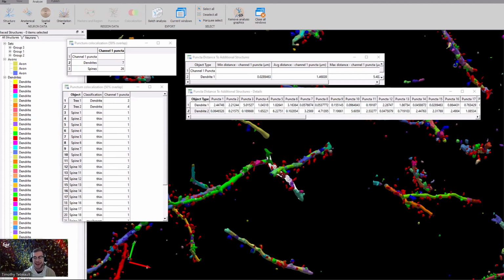If you do have different time points you're working with, Microdynamics does preserve that information. With that repeated imaging process, it's going to keep track of those time points automatically for you so that you can identify changes over time to those dendritic spines. So I would point you in the direction of Microdynamics if that's what you're looking for particularly. But for just details on spines, this is going to be a fantastic tool to get you started.